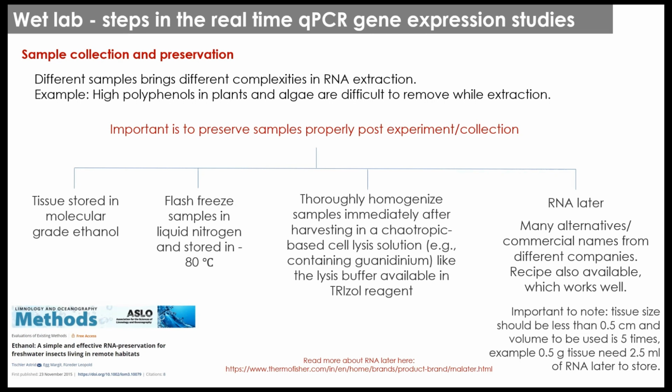Another important thing is that whenever you are doing RNAlater preservation, you cannot do it on an already preserved sample. You have to do it on a fresh sample so that RNAlater enters within the cell, right, or within the tissues and protects the RNA.